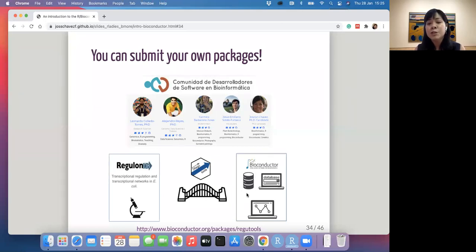So we have functions to connect with the database RegulonDB, also to explore the database, which means exploring the datasets contained, and also to subset or filter some data of interest, and also to plot some of these data.